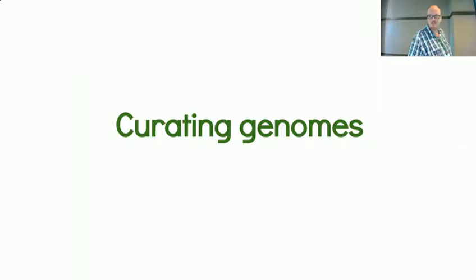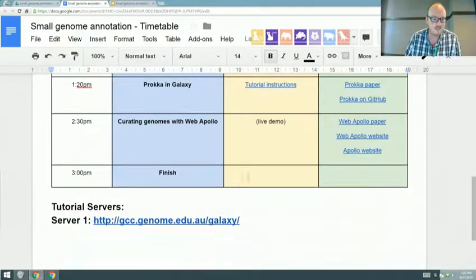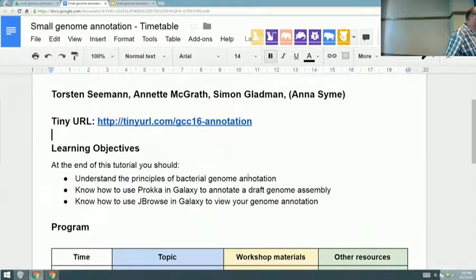No, I don't have slides on each subtool. So I think what we'll do now is we're going to just do the tutorial. We're going to get a feel for it and look at an annotation. So if we go back to the program, has everybody gone to this URL here? Put your hand up if you still need me to have it on the screen. Yep, we'll wait.